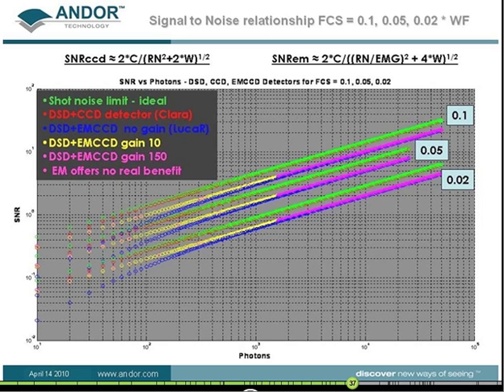And in this case, I've chosen 0.1. So essentially what we're saying here is that in order to get a good signal-to-noise ratio from the confocal instrument, we need to choose the fractional confocal signal to be a relatively high fraction of the wide-field signal.